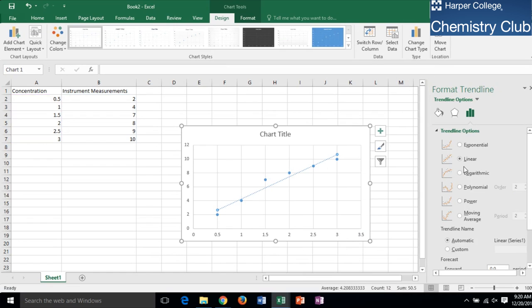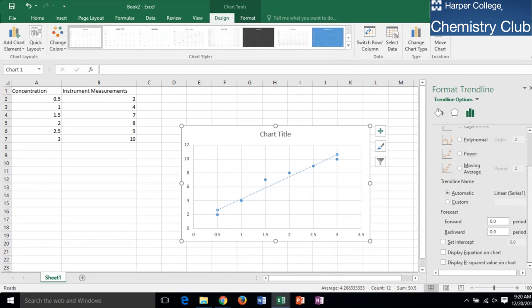Select Linear for the type of graph, then scroll down and check off Display Equation and Display R-Squared Value at the bottom of the Options menu. Close the sidebar.